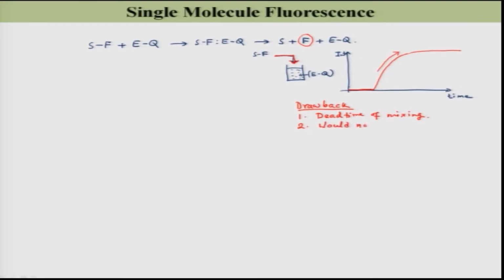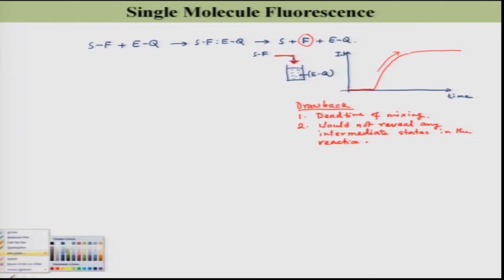It would not reveal any intermediate states in the reaction, right? So what is the solution? The solution is single molecule level spectroscopy, single molecular fluorescence.